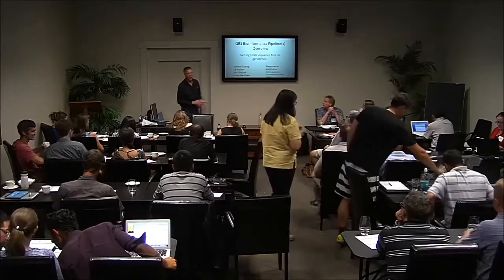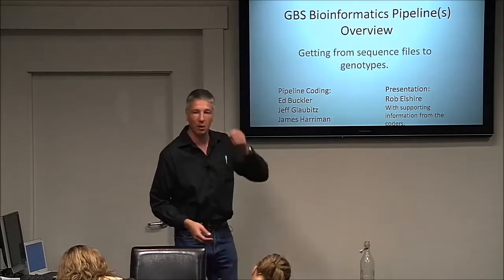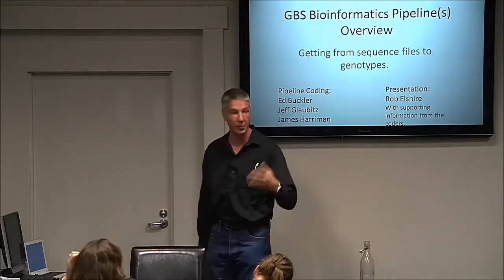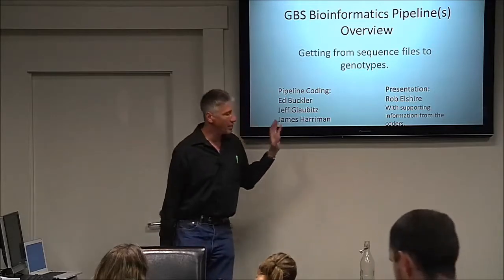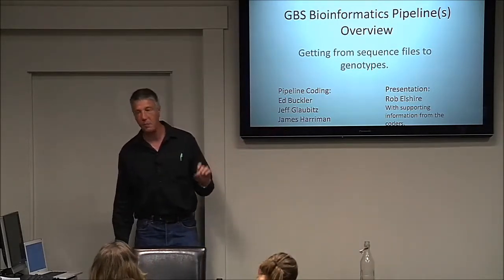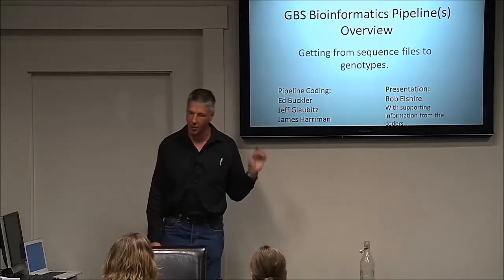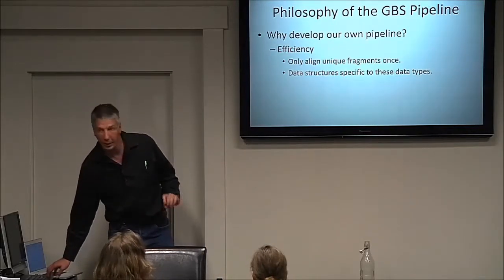So this section is going to be on the GBS bioinformatic pipelines. It's an overview, so getting from your sequence files to genotypes. I'm doing this presentation, but I didn't do any of the coding of the pipeline itself. I wrote a lot of code to wrap it up and do the logging and the reproducibility that I talked about this morning. This talk today is going to be focused mainly on the reference-based discovery pipeline. And we'll tell you about the other things briefly, but this is primarily about that.